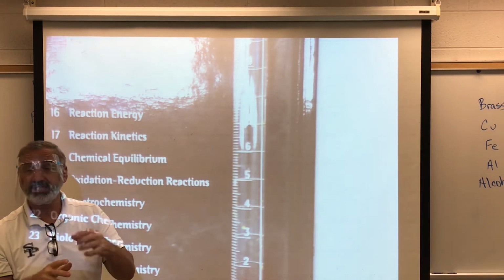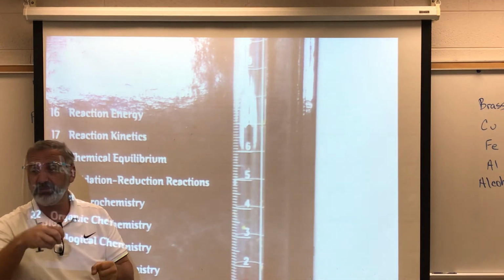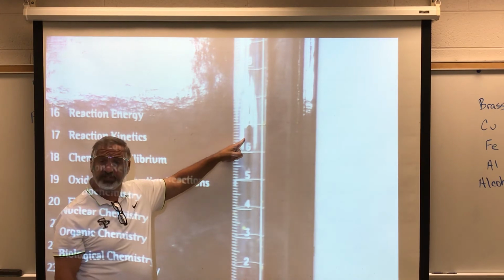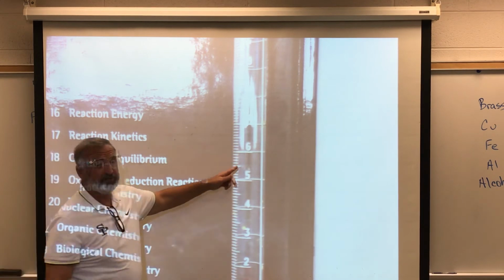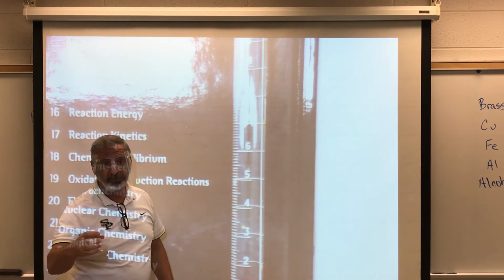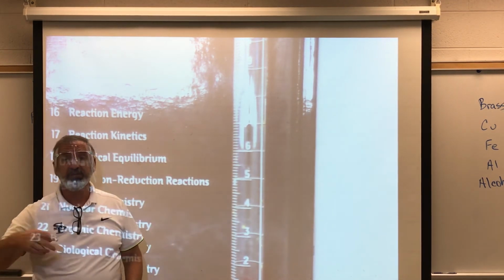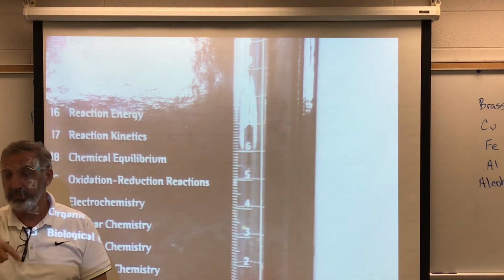Okay? Once it's hot, you can use those orange hot hands and take it off the fire, but then while it's hot, go ahead and add in your 8 milliliters. So you might want to, they kind of messed this up before. Get the 8 milliliters first. Because some of them in first period, by the time they went and got the 8 milliliters and came back, it had cooled off and it started solidifying again, coming out of solution. So get your 8 milliliters first. Have that ready to go. Once it's all dissolved, just mix it while it's hot. We're going to stir it.